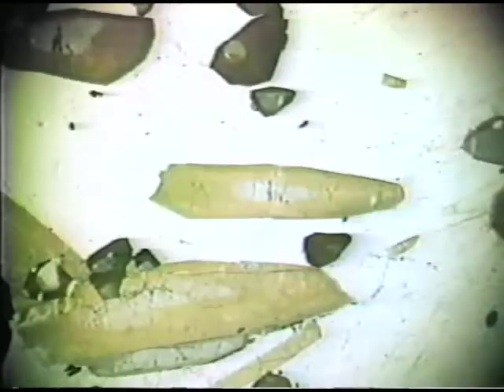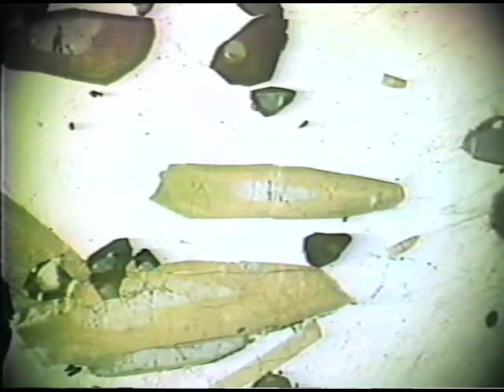So I've got the E ray now exactly in an east-west position and exactly parallel to the microscope polarizer. And here you can see that the color of the tourmaline is very weak. And compare this color to what the color is when I turn the E ray to the north-south direction. So I'm going to rotate it so that the E ray is now in a north-south position. Okay? I'll repeat that rotation into the north-south position.